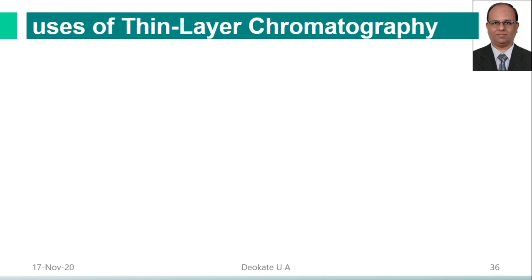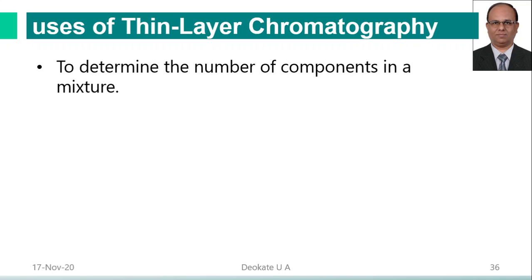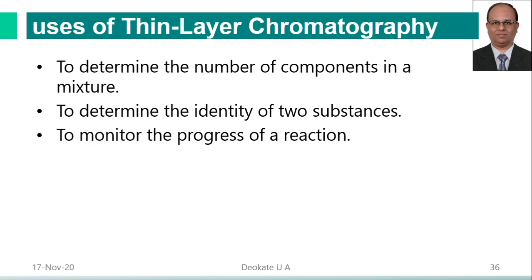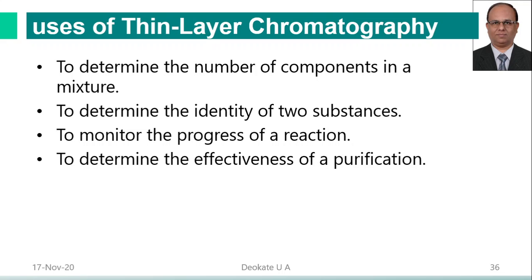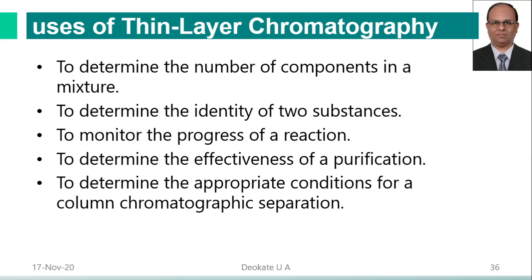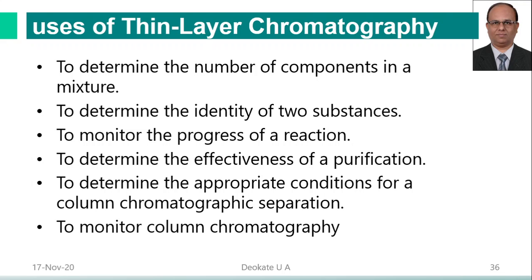The other uses of TLC include determining the number of components in a mixture, determining the identity of two substances, monitoring the progress of a reaction, determining the effectiveness of the purification process, and determining the appropriate conditions for column chromatography.